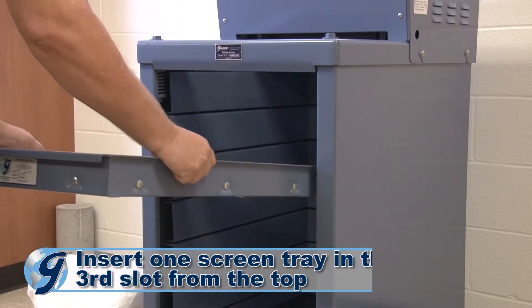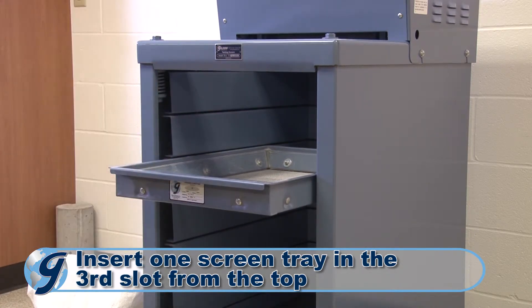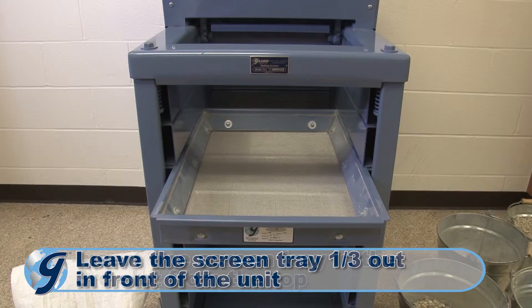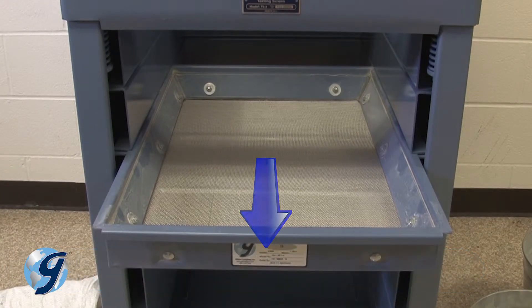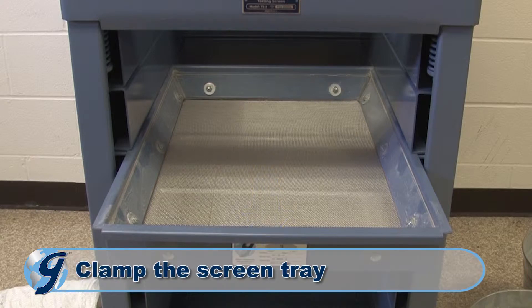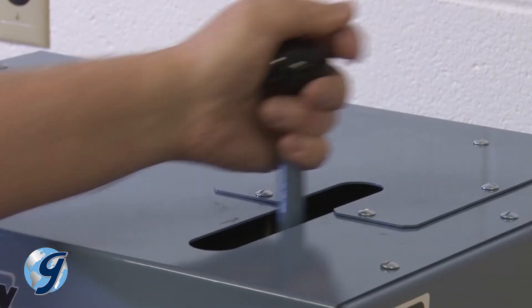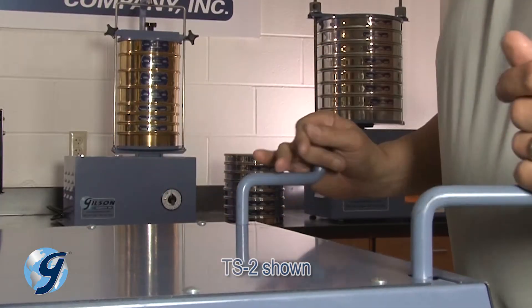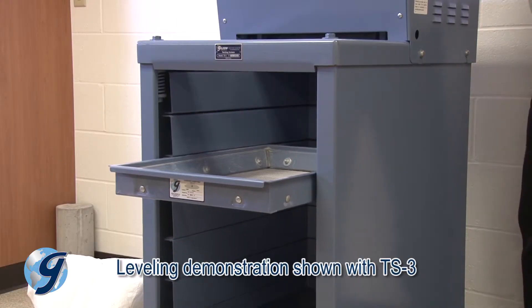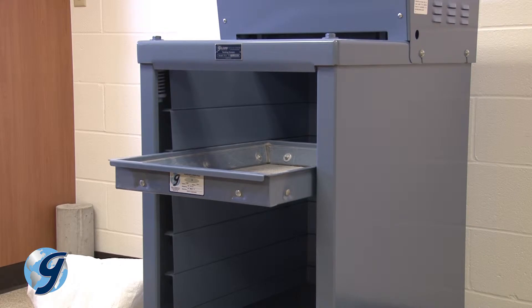Insert a single screen tray into the third screen tray slot from the top of the separator, leaving one third of its length extended out of the front of the machine. Next, clamp the single screen tray in the separator by either applying short strokes to the hydraulic pump handle, or by simultaneously turning the manual clamping handles clockwise, depending on which testing screen you have. Use your sense of touch to determine when the single screen tray is firmly clamped.